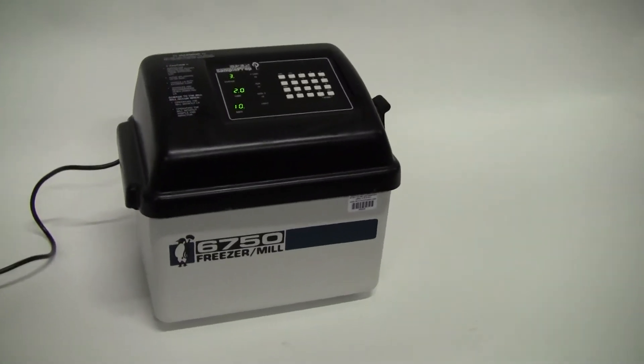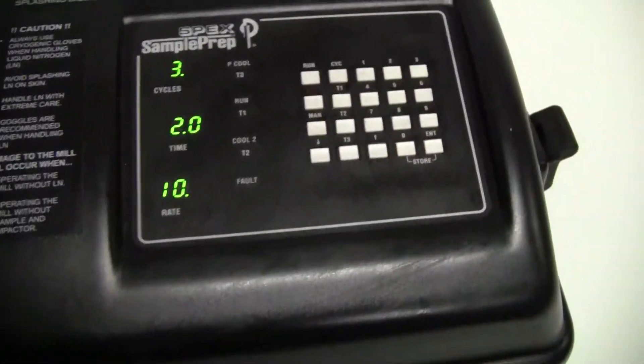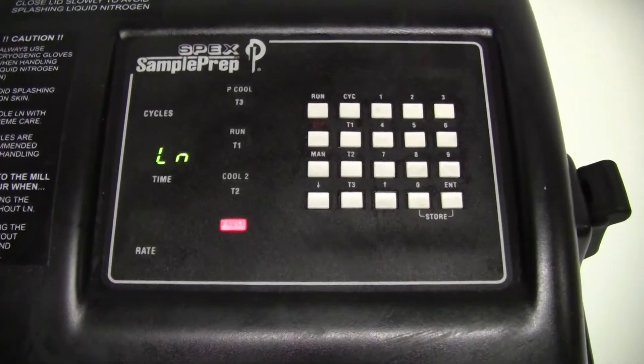Good afternoon from HiTechTrader. This is the 6750 Freezer Mill Spex Sample Prep. All the buttons work, but when you go and hit run, you get a liquid nitrogen fault.